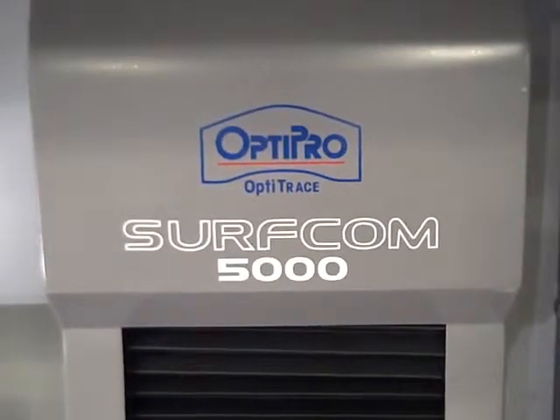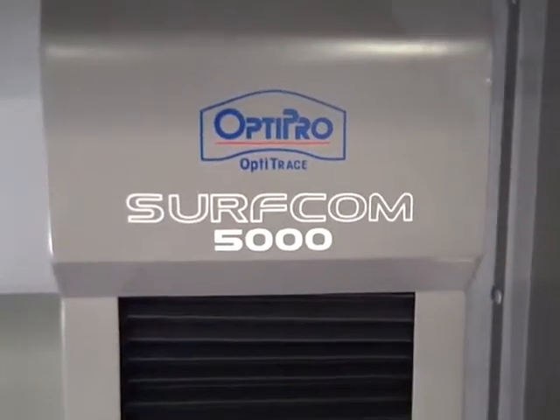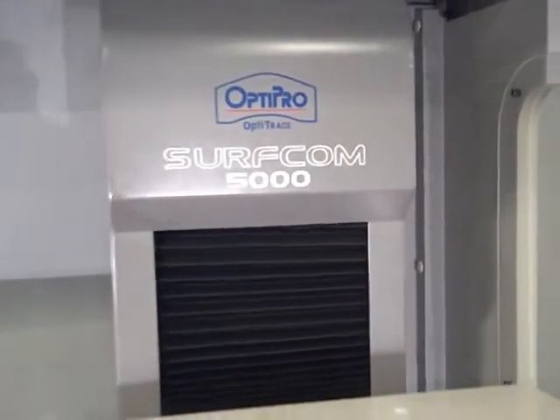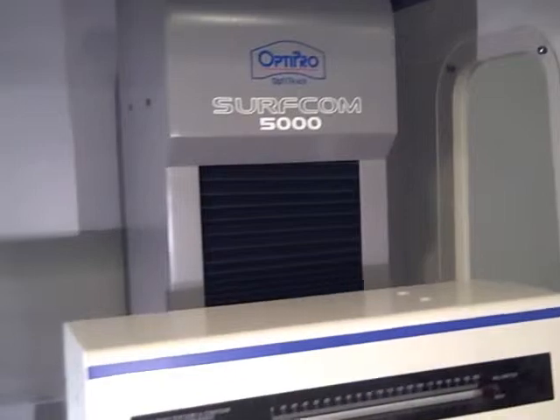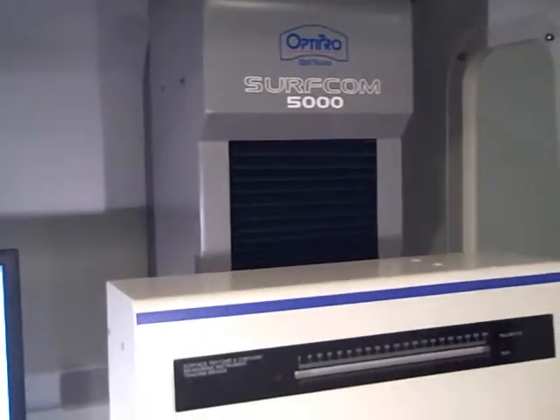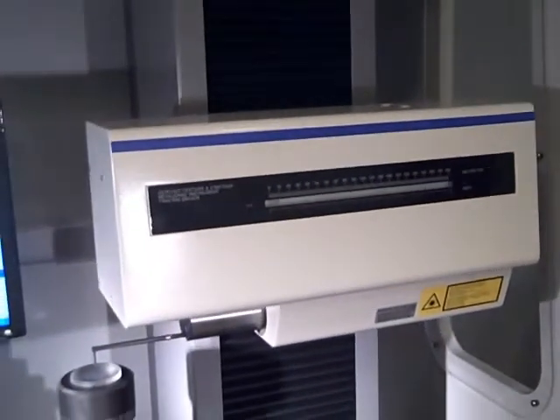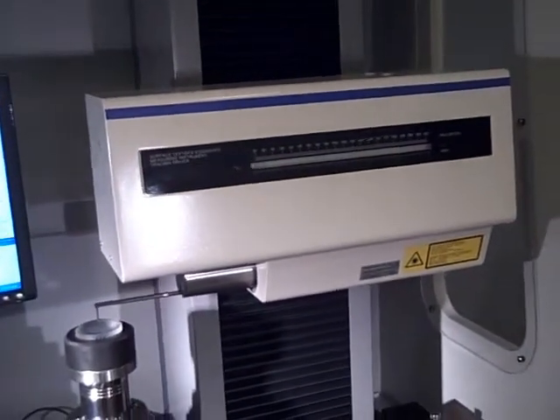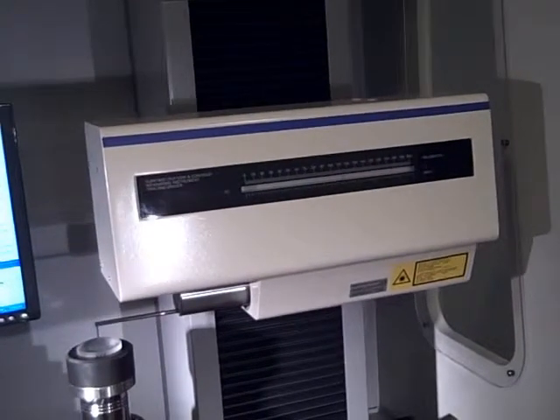The OptiTrace 5000 incorporates the Zeiss Surfcom 5000. The X-axis travel is 200mm. The Z-axis travel with the stylus is up to 32mm, dependent upon the arm length.